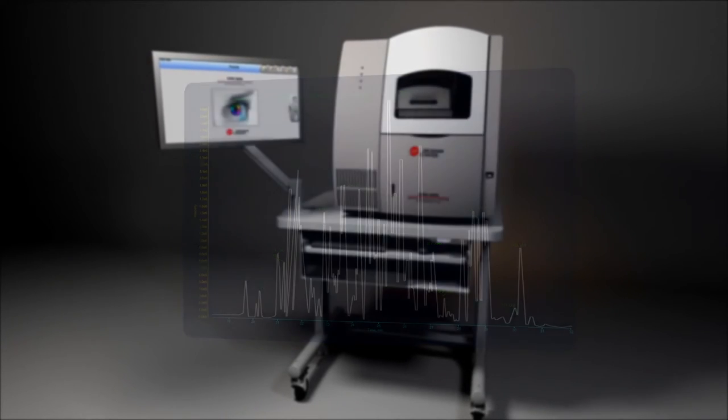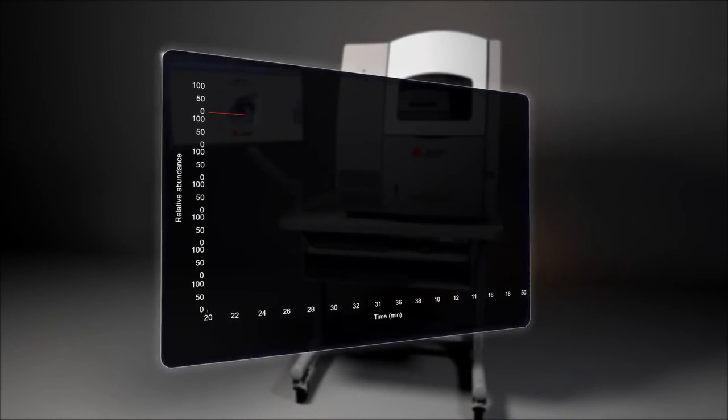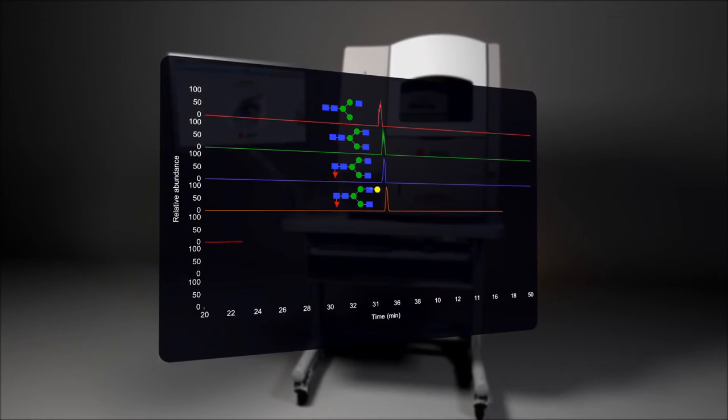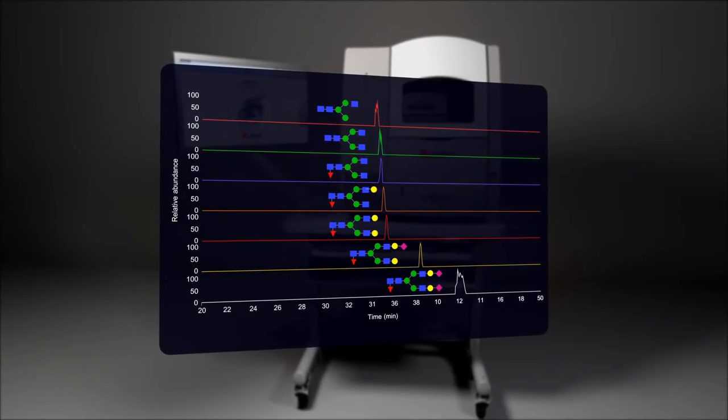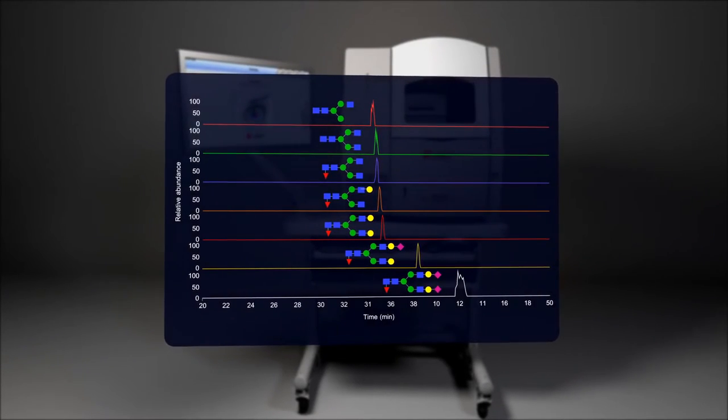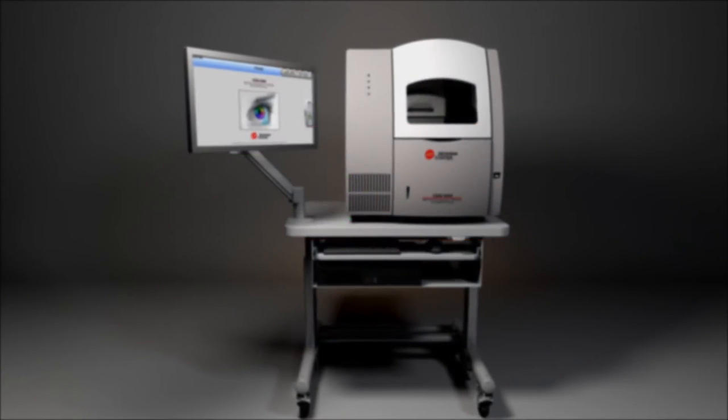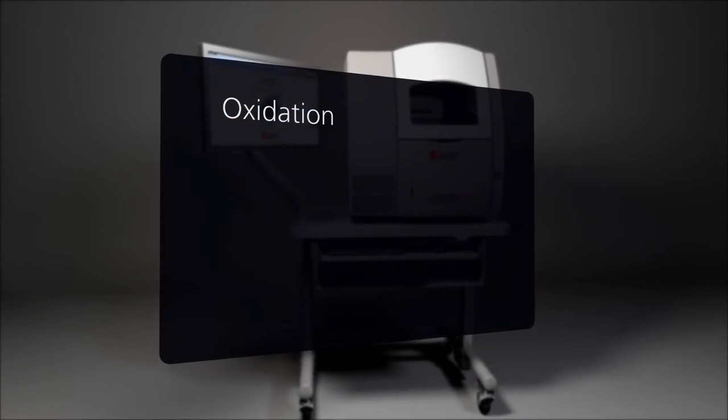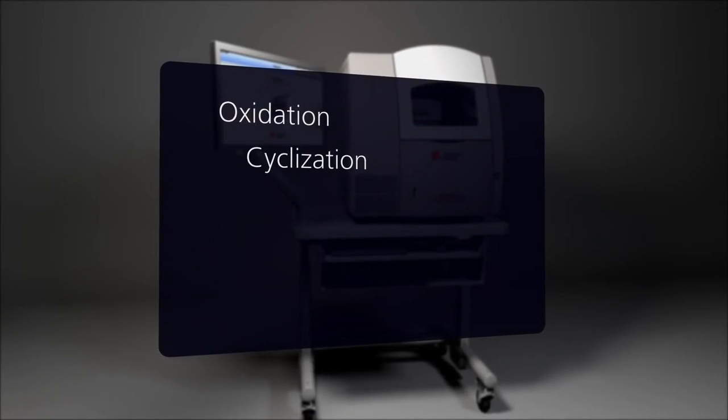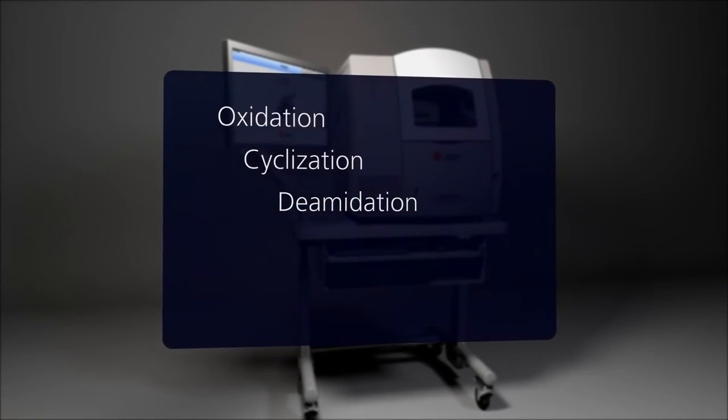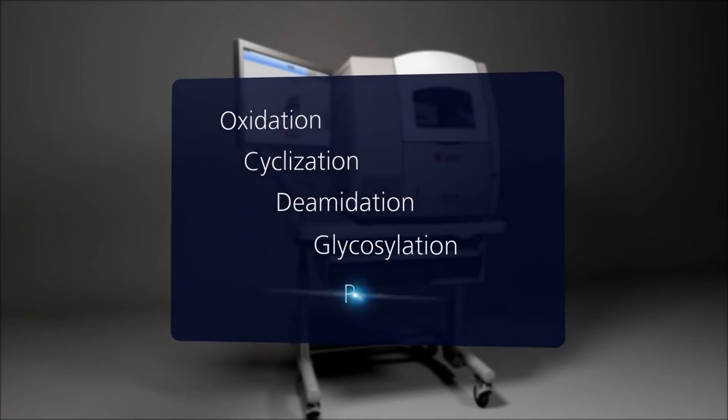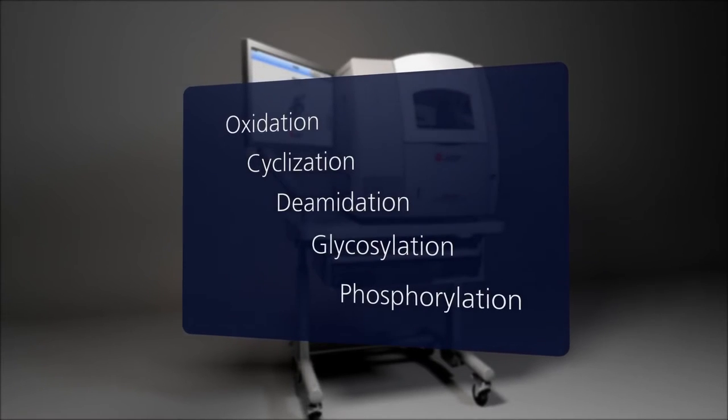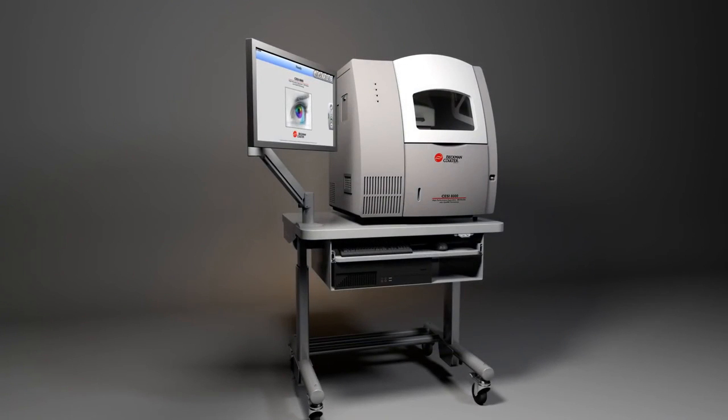You will now be able to see species that didn't ionize before, because the amazing ultra-low flow rates of the CESI technology increase ionization efficiency and sensitivity. You can now hunt down hard-to-spot post-translational modifications, such as glycosylations and phosphorylations, which are separated and detected as never before.